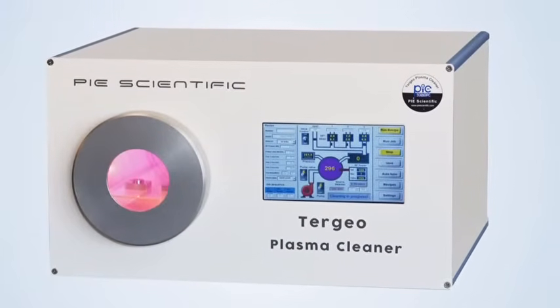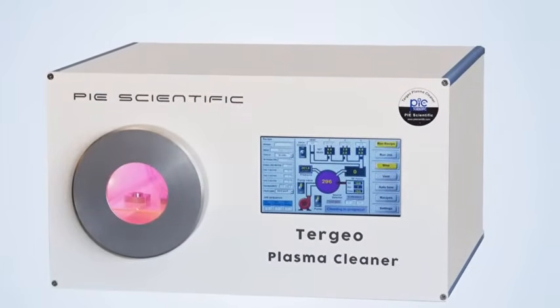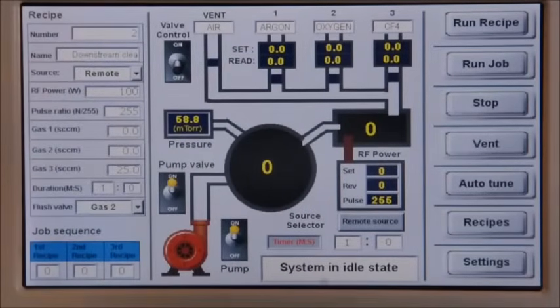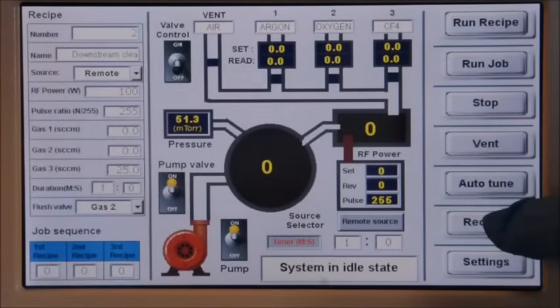The operation of Tergio Plasma Cleaner is extremely simple and intuitive. Here is how to run a plasma cleaning recipe. First, go to the recipe library to load our recipe.